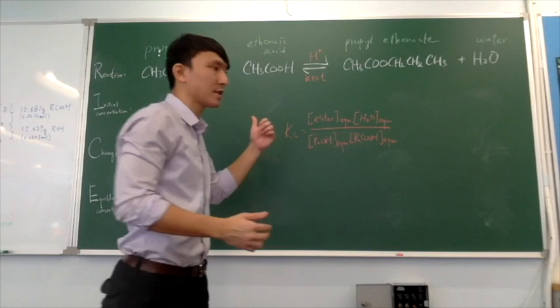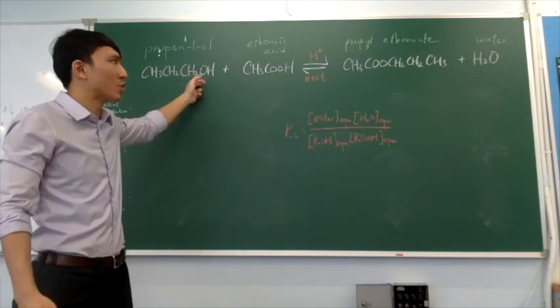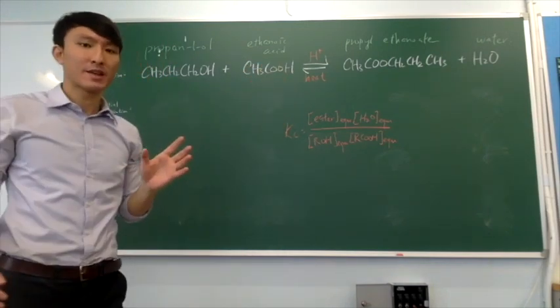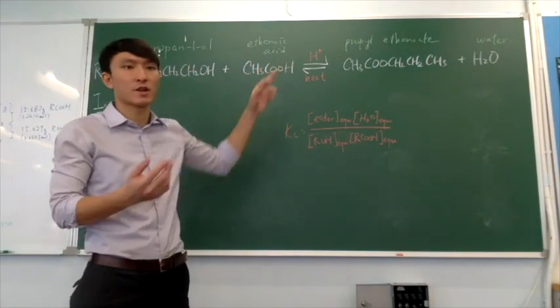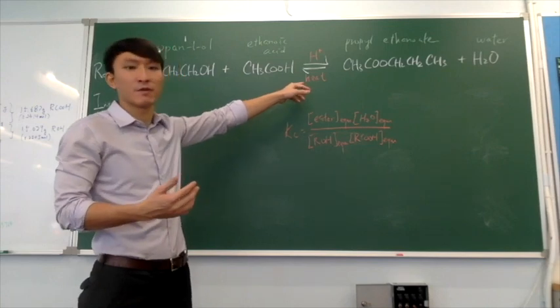So first of all, in this experiment, we are looking at an esterification reaction between propan-1-ol and ethanoic acid, forming propyl ethanoate and water. And this is a reversible reaction catalyzed by concentrated sulfuric acid, and it must undergo heating under reflux.